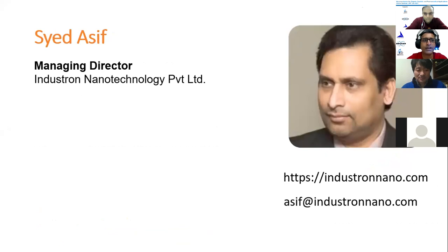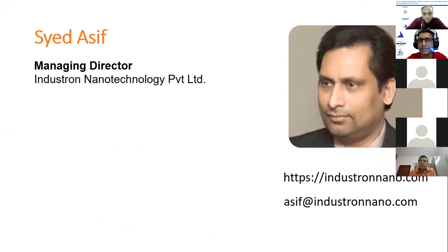And then we have Syed Asif. Asif is responsible for much of what we have in nanoindentation, most of the development of the technique itself. It's not a very old technique, although it was known for a long time. This instrumented indentation has seen a lot of improvements in the last couple of decades. Asif was instrumental in developing this technique itself. Many components in nanoindentation are credited to his inventions.